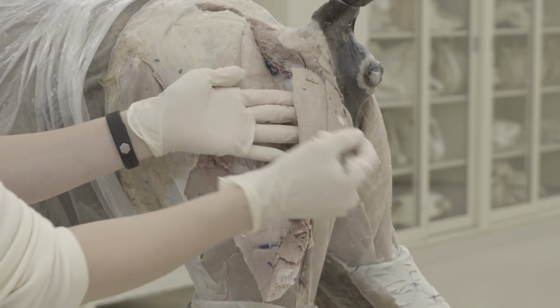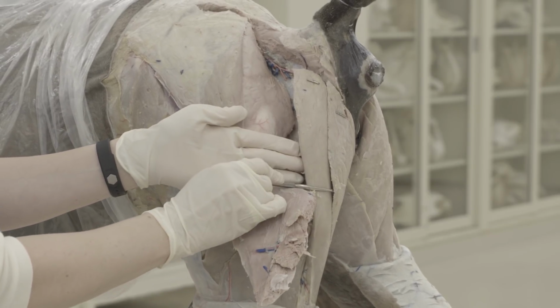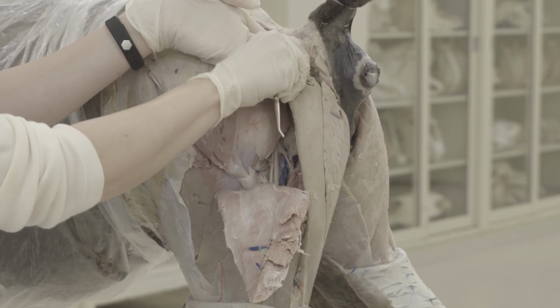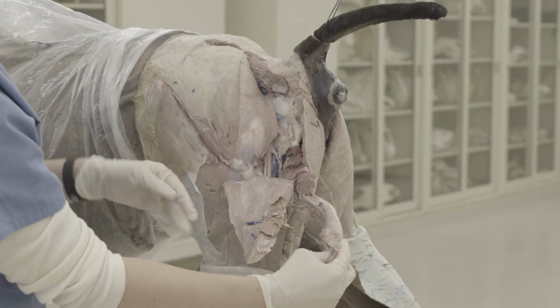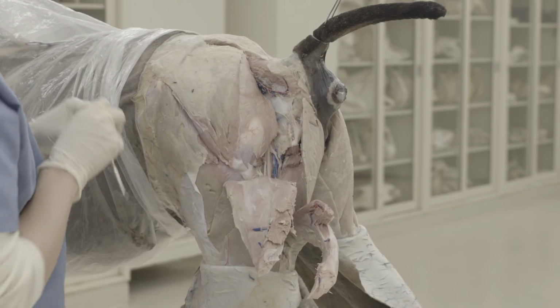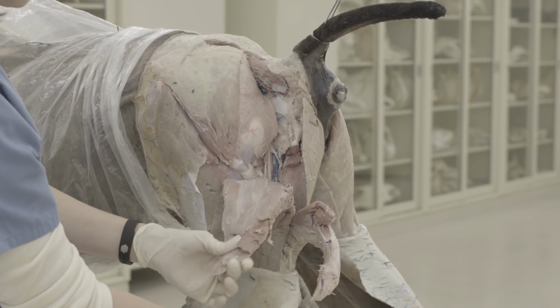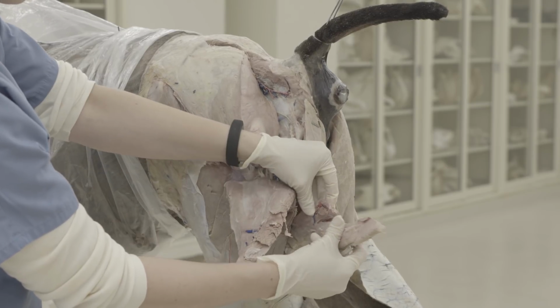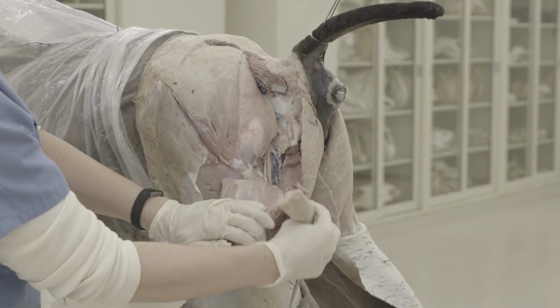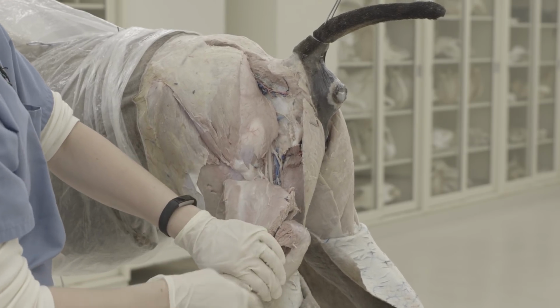So you're going to try to identify the border first between the semitendinosus muscle and semimembranosus muscle. Then you'll cut it proximally, and then reflect it similar to your biceps femoris here. So you actually just take that down similar to that biceps femoris, so both of them are reflected towards the stifle. So on your semitendinosus, you can kind of see there are two parts here, and it'll kind of come away as two parts. So don't worry about that. You can just cut both pieces away from the pelvis and then reflect them distally.